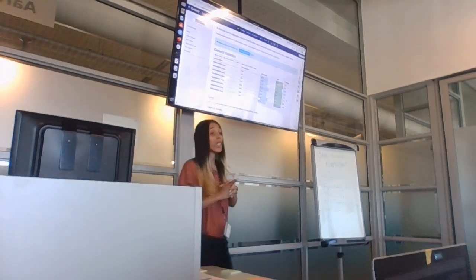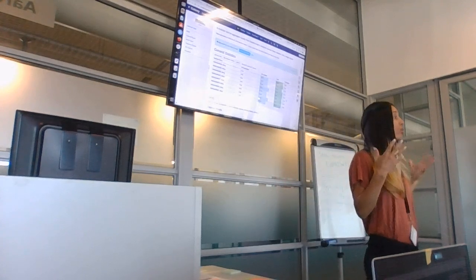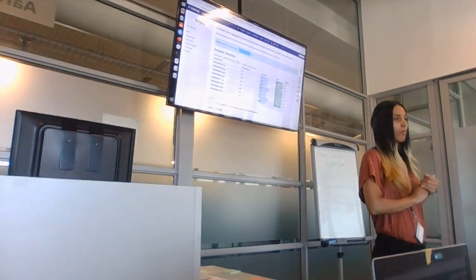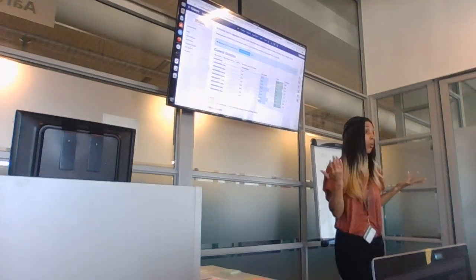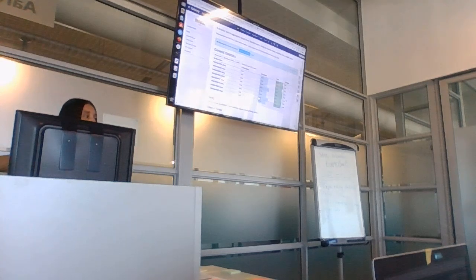If you were looking at that report and I wasn't here, and you're not nervous about what you're going to say, and you're actually just looking at that report, are there any samples that stand out for you? She says 2. Does anybody else find 2 samples stand out? More? Less? None? I think 1. We've got a 1, we got a 2. Okay, so which one do you think stands out?